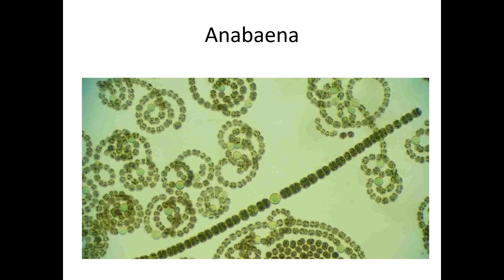Next, Anabaena — this one is blown up much more, probably at oil immersion. Each one of these little balls is its own cell, and as you look at it you should be able to tell there is no nucleus inside those cells. So Anabaena is an example of a prokaryotic organism. It's kind of plant-like because it does have chlorophyll and is capable of photosynthesis, but there is no nucleus present inside those cells — doodle a bunch of little balls held together in a chain.